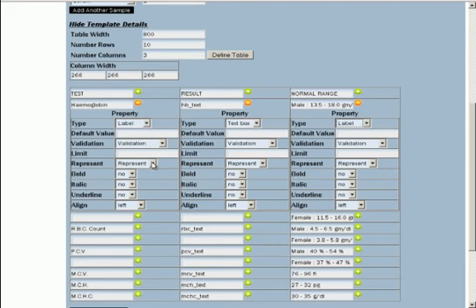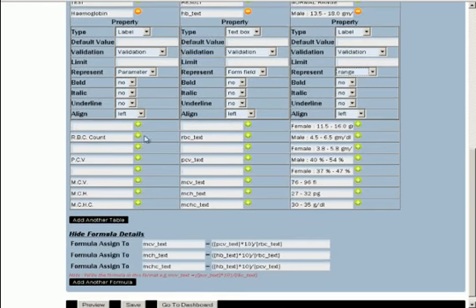There is a green plus sign next to each parameter which is entered. Simply click on it to maximize it. For each parameter, you can go and enter different parameters and values.